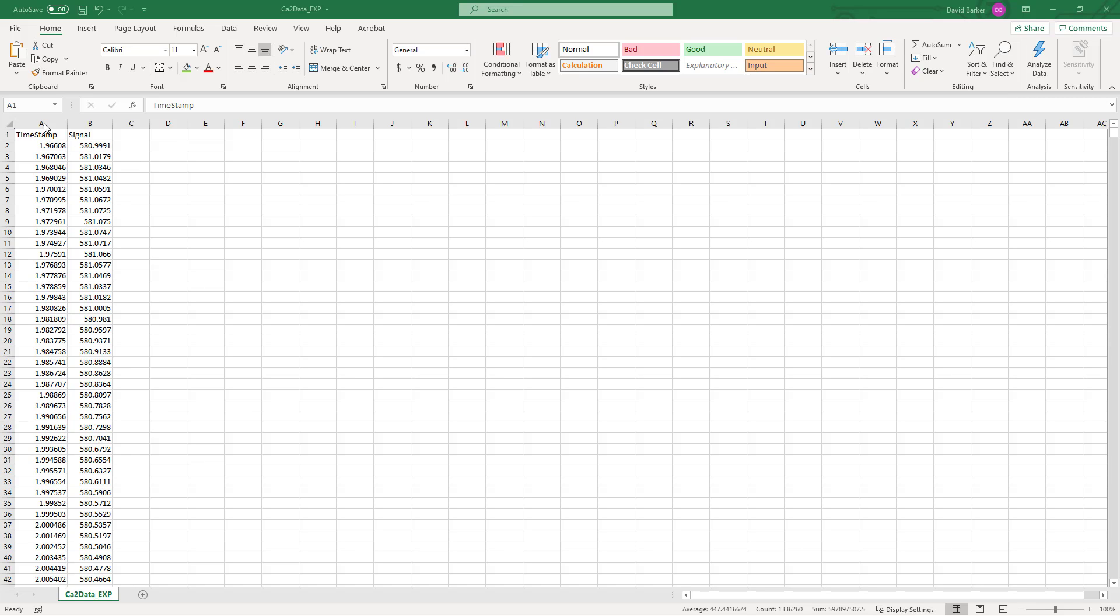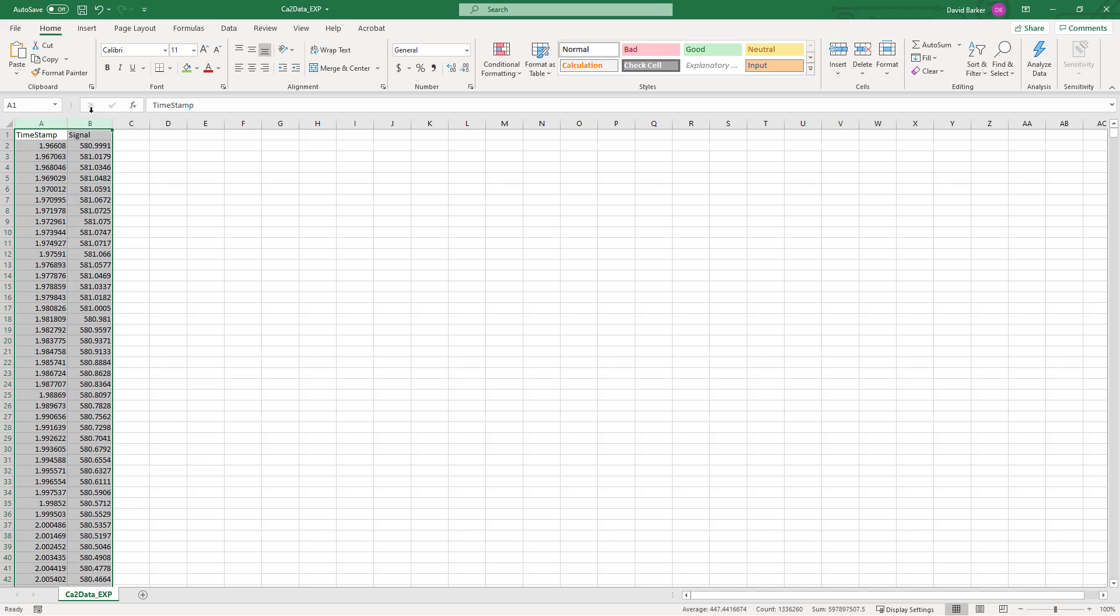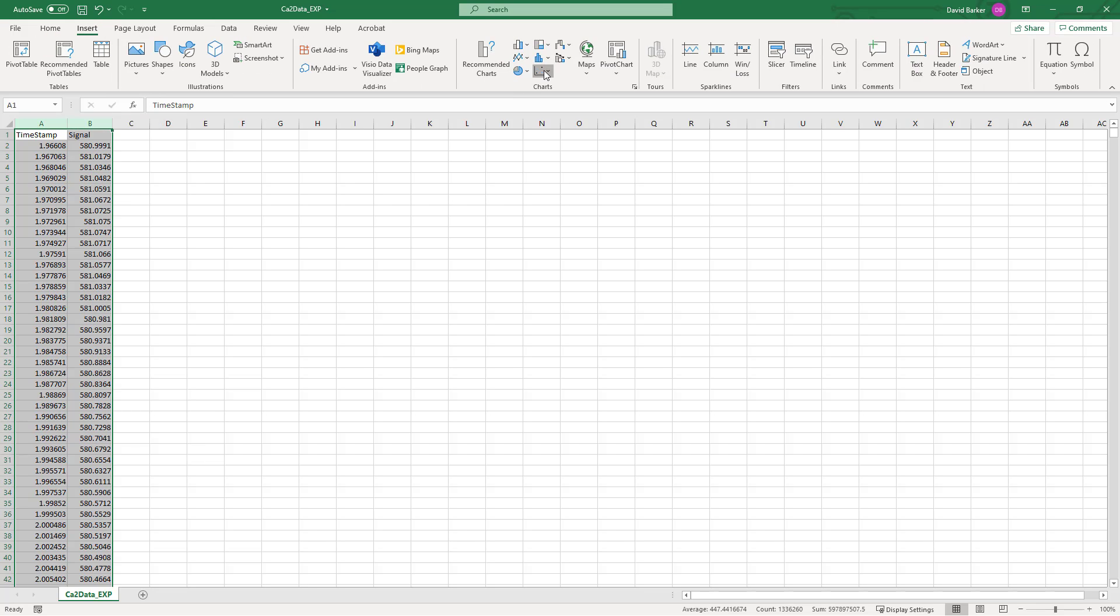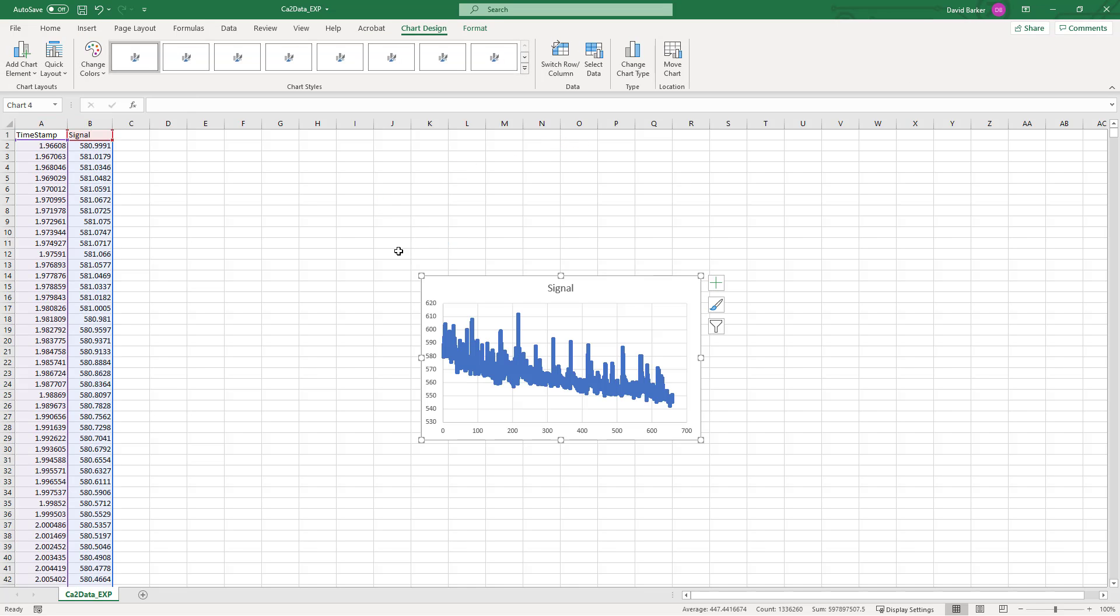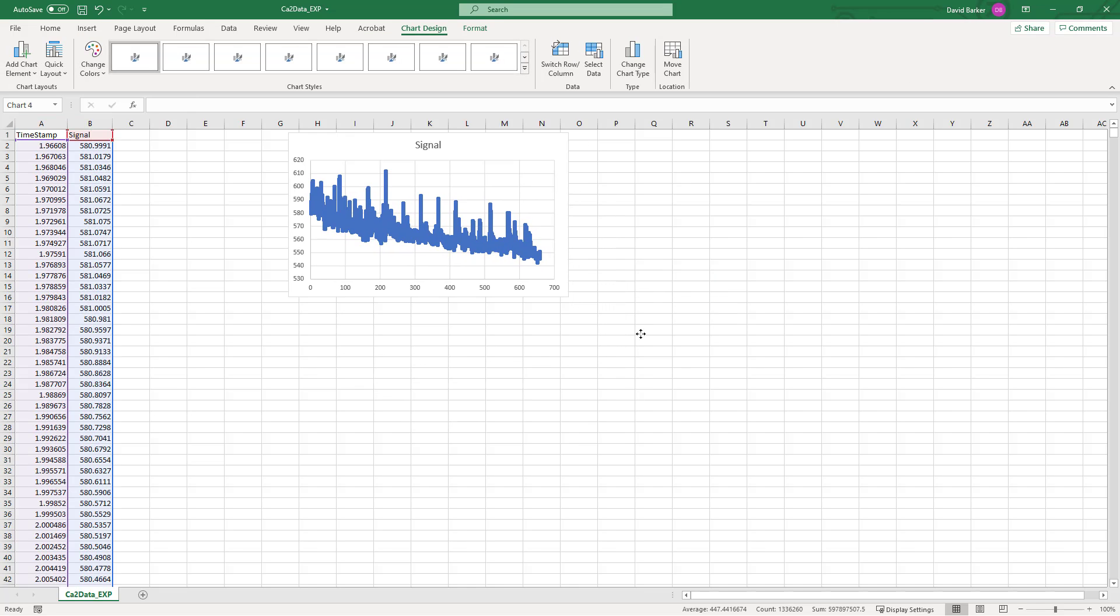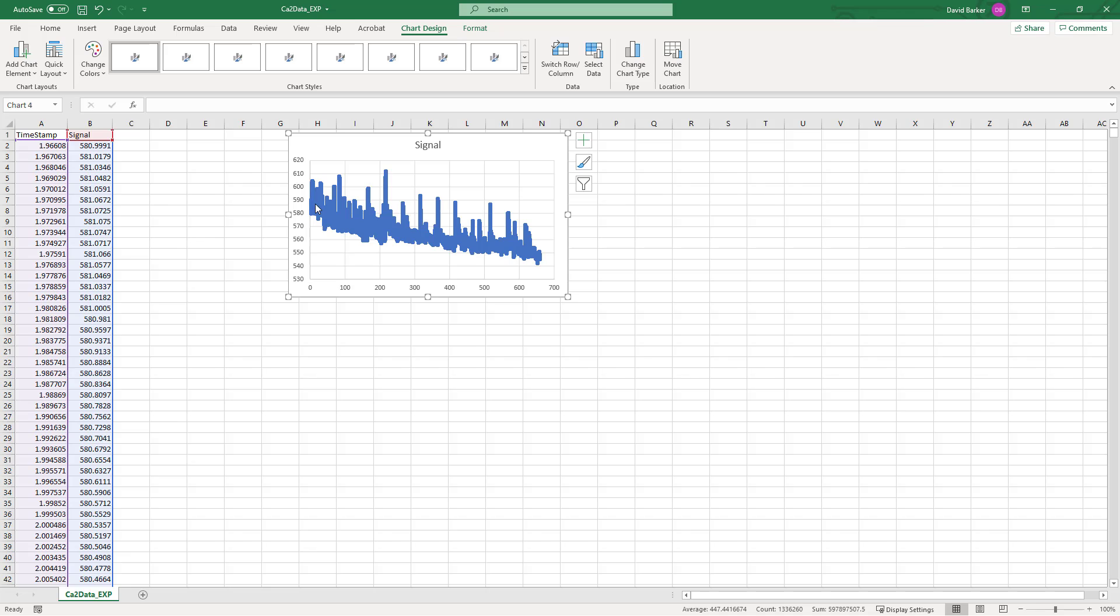Let's take a look at the reason for this. If we just come in and make a plot of data that only has timestamp and signal, then what you can see from this data is that in many cases you're going to have some sort of drift over time. The data here starts out at much higher values around 585 and drifts down by the end to where we're at more like 550 or 545.